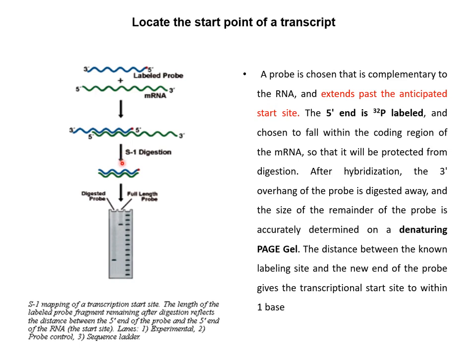Then you digest with S1 nuclease, and you'll see that only the double-stranded region is left. The single-stranded region is digested. Then you find the size of this fragment on a denaturing polyacrylamide gel, and you'll see what the size is.